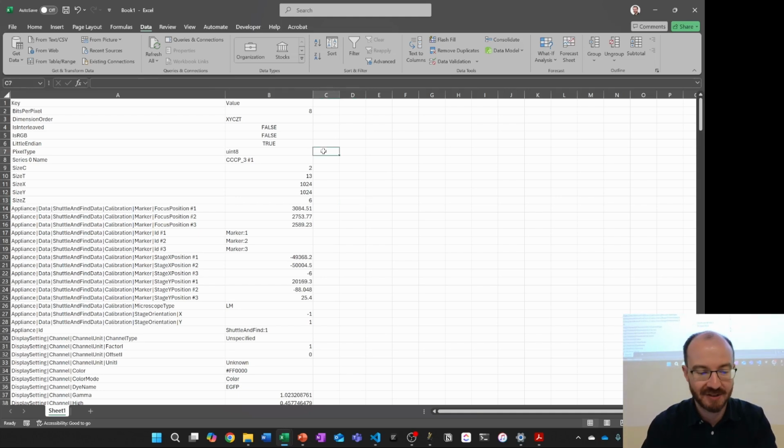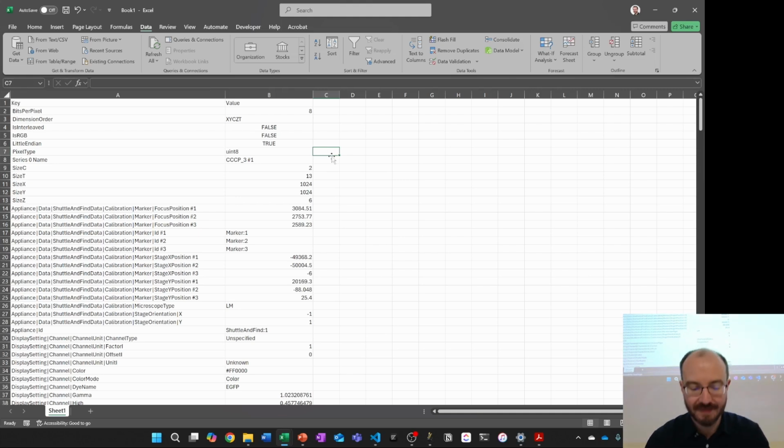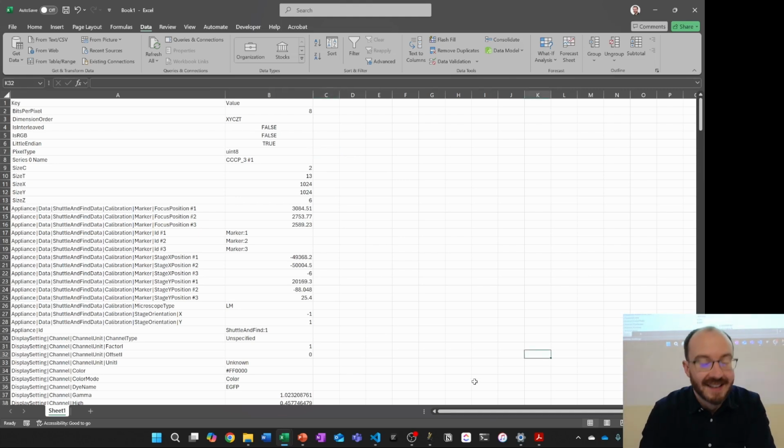Okay, but has everybody got to this point? You've got your metadata open in Excel. Yes. I'm glad, thank you.